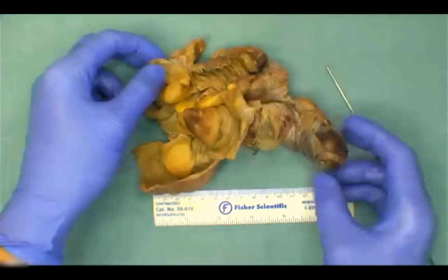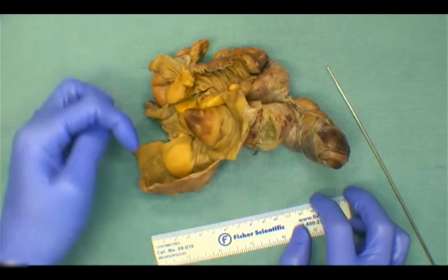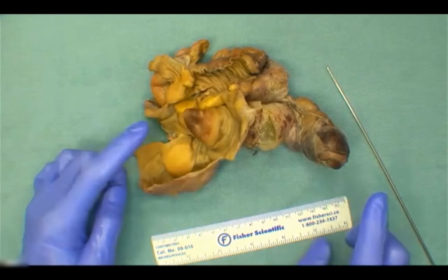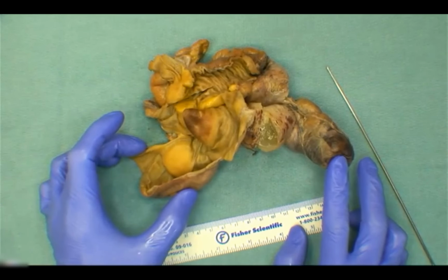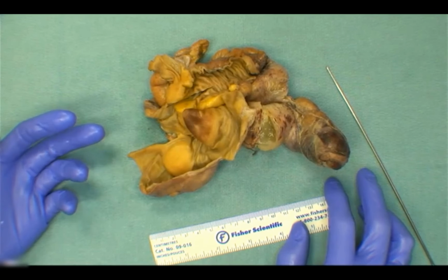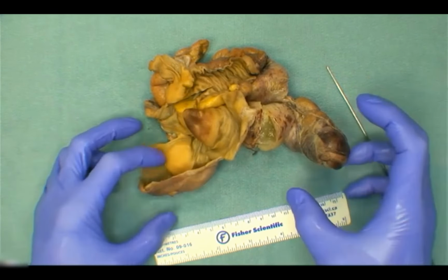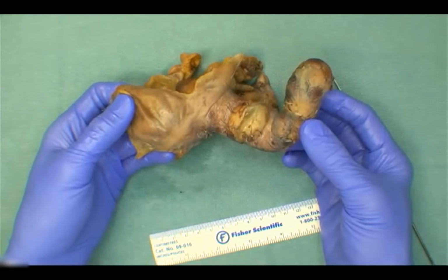When it comes to the actual grossing, we're going to measure the individual components of our specimen. So the ileum, the ileocecal valve, and we'll give a length and diameter of our appendix, and then also of our cecum. The first thing to do in the gross is evaluate the serosal surfaces and the adhesions noted along the appendix, making note that it was intact, that there weren't any defects.